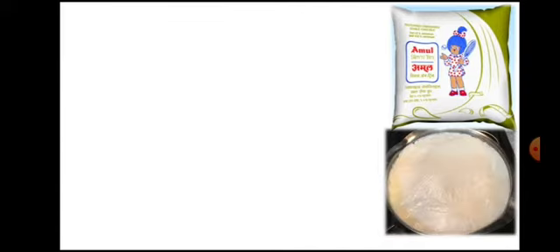So the requirements for this practical are pasteurized milk. Then instead of pasteurized milk, we can make use of boiled milk. Now why pasteurized milk and boiled milk? Because these two are going to indicate the negative control.